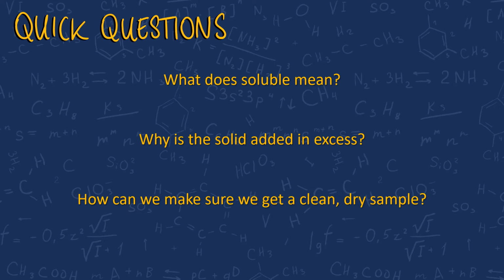Okay, number 1, soluble means it can dissolve in water. So insoluble means it can't dissolve. Number 2, why is the solid added in excess? That is so we can make sure that everything has reacted fully. Number 3, how can we get a clean, dry sample? We filter out the excess solid, so we are just left with the salt solution.